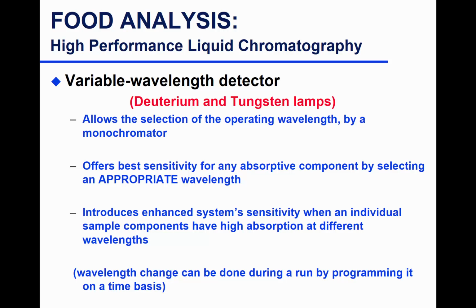So it will hit either a diffracting unit or a prism. What happens when it hits that grating diffracting unit is your light will be split into individual wavelengths. Let's say here it is lambda of 280, 290, whatever, and there's many in between, and so on. If this is a deuterium lamp, it will go between 200 and 400.